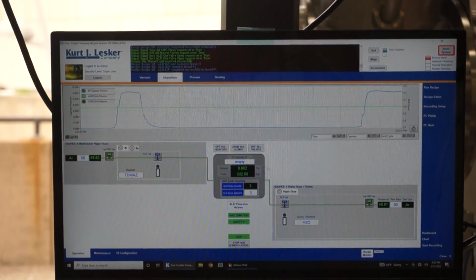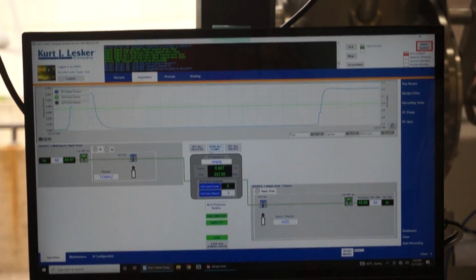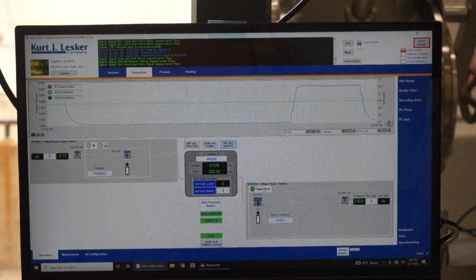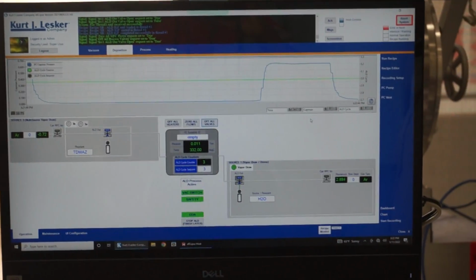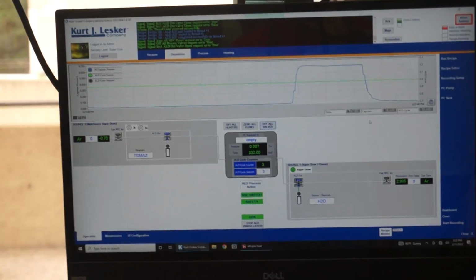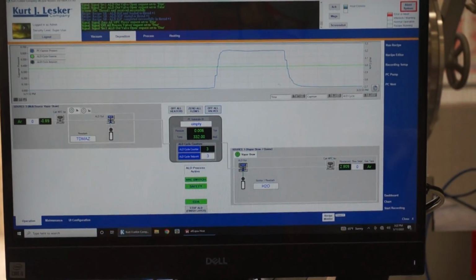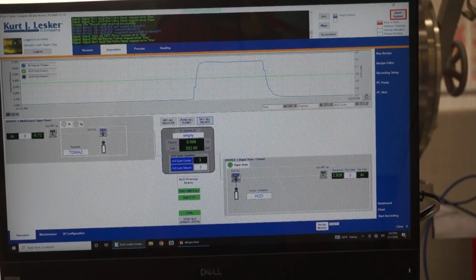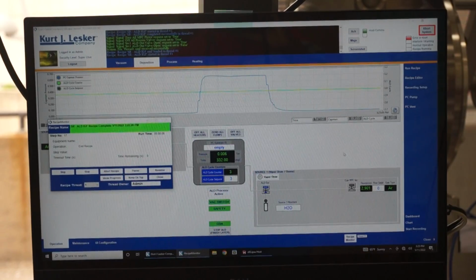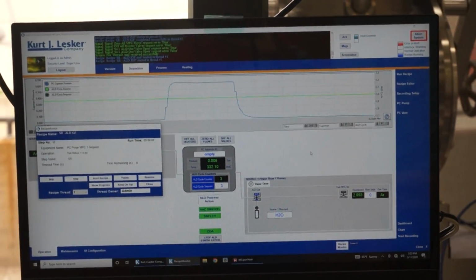And then we just repeat that for a third time. So zero flows, turn off all valves, and then open it. So that was the third time. We're done with the pump purge procedure. Say the ampule has been pump purged. It hasn't been conditioned yet. That's different.